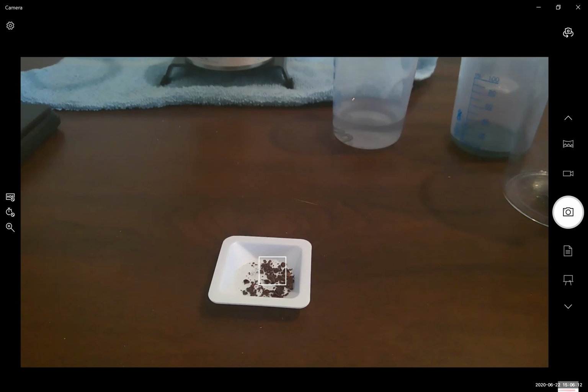For the mass of the aluminum and copper, it was found to be 2.6 grams, and you can double check that in the recording. Any other questions I can address? If not, we'll close out this experiment session. We'll clean up, and then we'll discuss the laboratory calculations. The copper gluconate was 1.4 grams starting of copper gluconate.